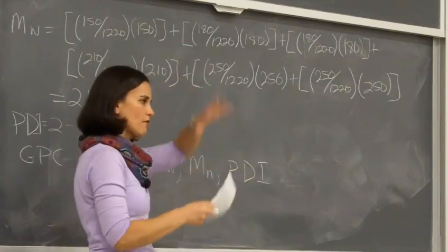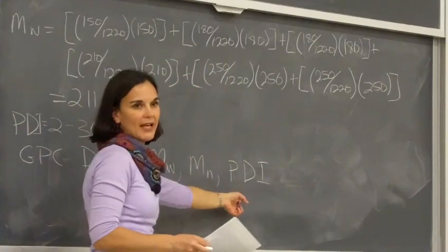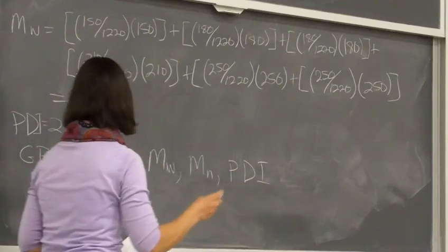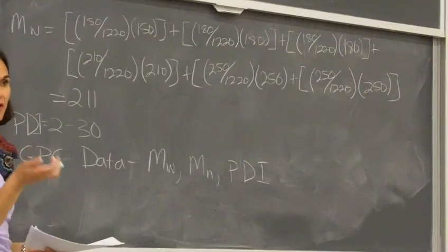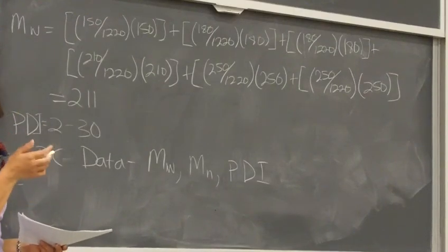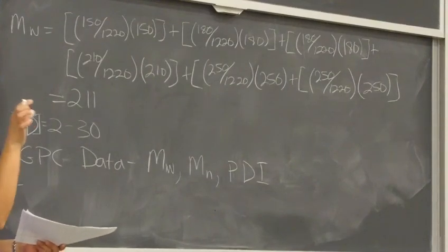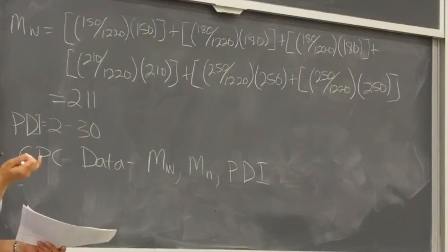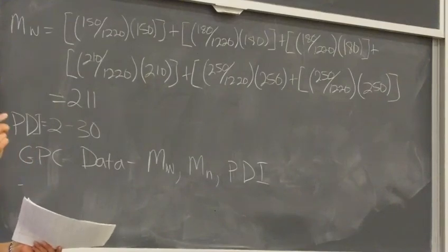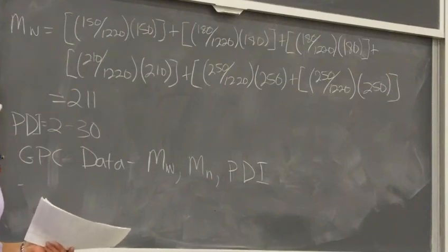You're going to get this whole sheet of paper with information all over it. These are the three things that you want to take out of that. Okay. Now for those samples, follow the instructions in the lab manual for prepping them. You want to make sure you use the THF that's labeled for making GPC samples, and all the materials you need for prepping are in the reagent kit, okay? You need an instructor or TA to help you filter. We have to filter these samples so no little particles go through the column because it would clog the column. So have your instructor or TA help you prepare the sample.